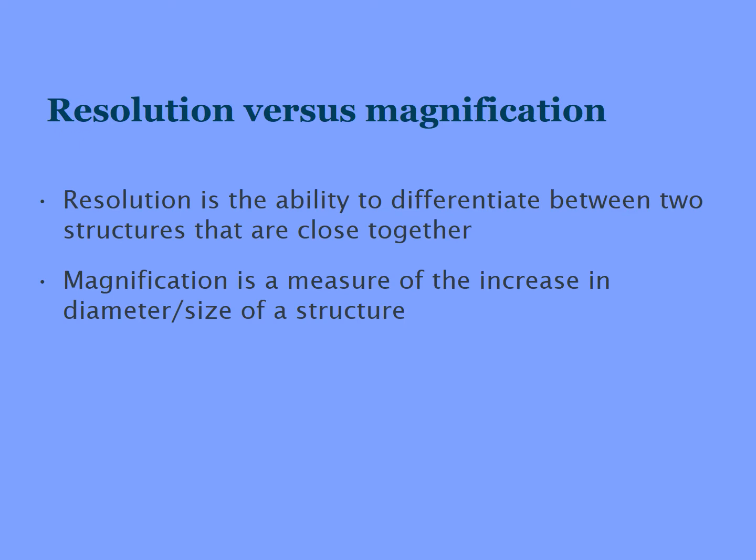It's important to distinguish between resolution and magnification. As I've said, resolution is the ability to differentiate between two structures that are close together. Magnification is just making things big. So it's important that you resolve things first and then you can magnify them, rather than the other way around.